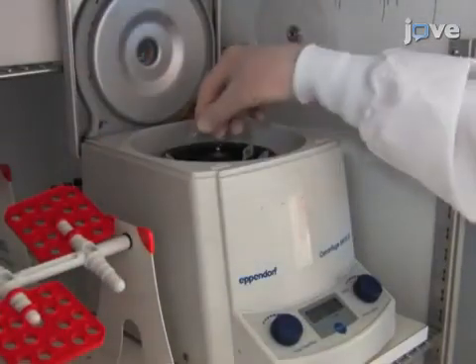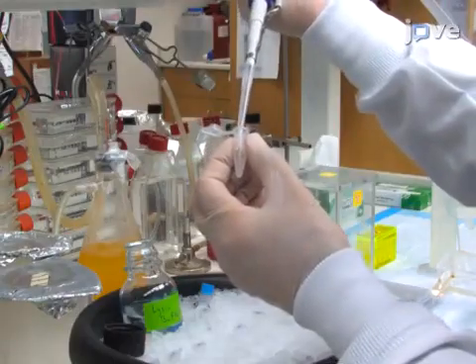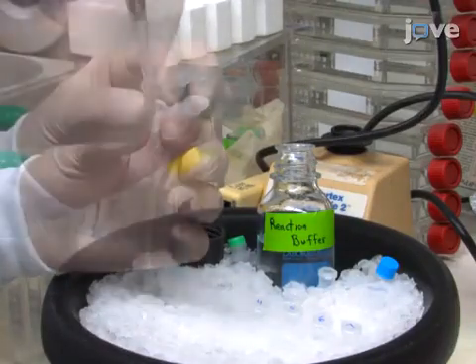Touch spin at 4 degrees Celsius to pellet the beads and remove the supernatant. Wash the beads 3 times with 1 milliliter of bead wash buffer followed by touch spinning. Then wash the beads once with 1x kinase reaction buffer.